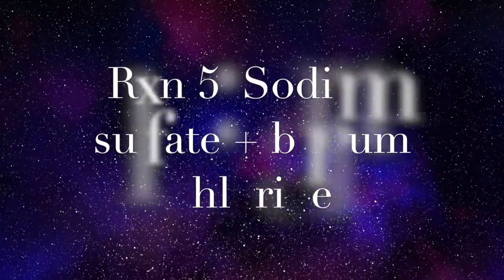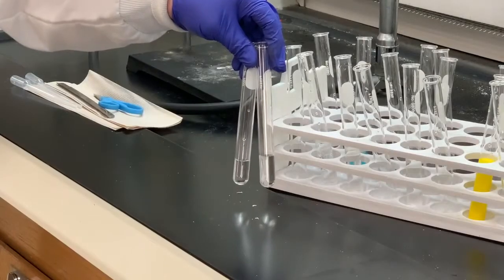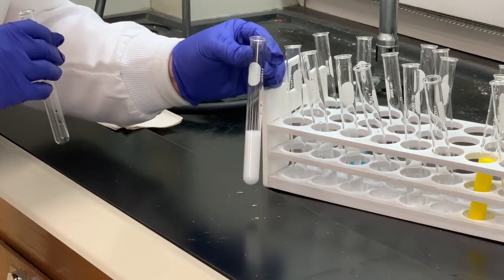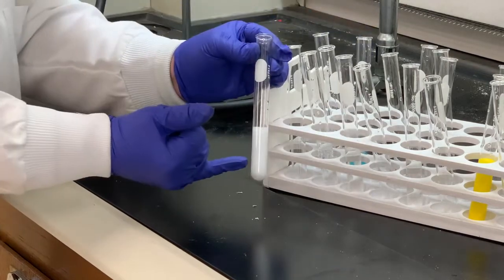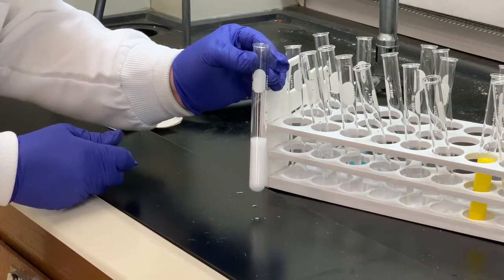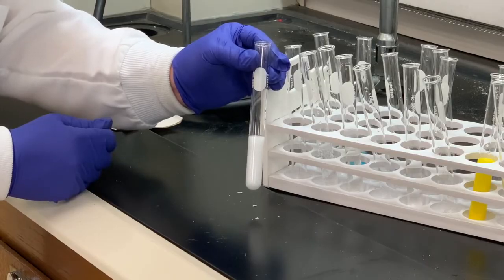The next set of reagents we're going to use is sodium sulfate and barium chloride, which are two colorless solutions. And notice what we formed there is a white precipitate. I didn't see any bubbles rising to the surface. I don't notice a temperature change, but we did form a white precipitate, and again, make sure you include the color of that in your observations. Did a reaction occur? We would say yes.